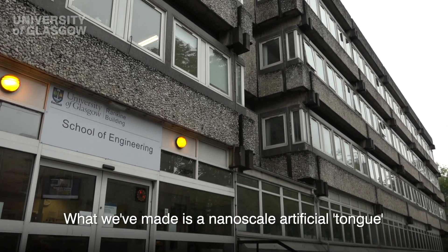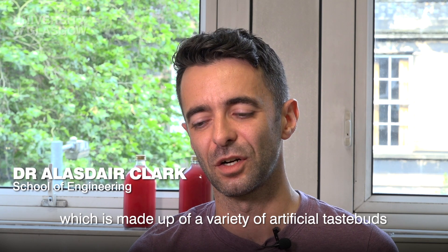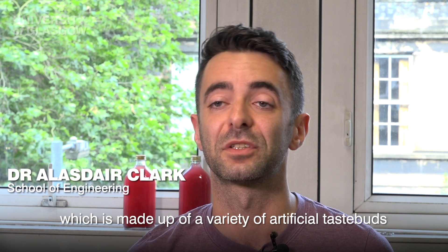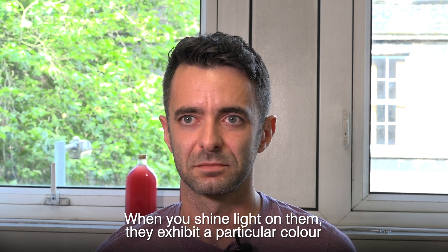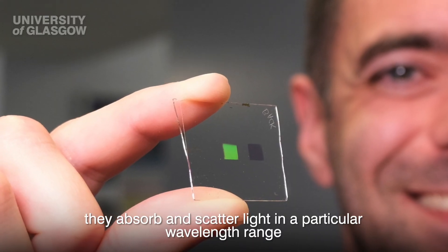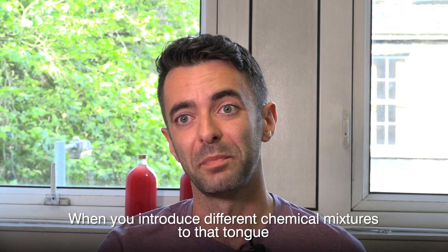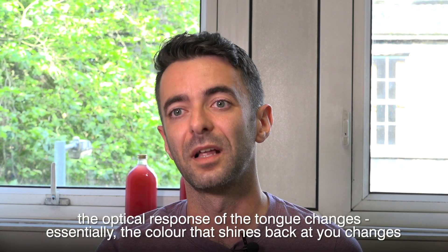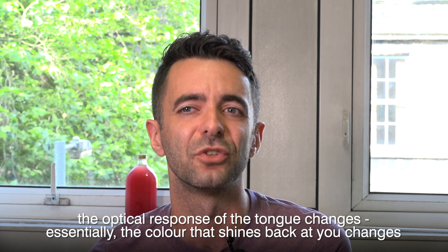What we've made is a nanoscale artificial tongue which is made up of a variety of artificial taste buds. When you shine light on them they exhibit a particular colour — they absorb and scatter light in a particular wavelength range, so they look a particular colour. Now when you introduce different chemical mixtures to that tongue, the optical response of the tongue changes; essentially the colour that shines back at you changes.